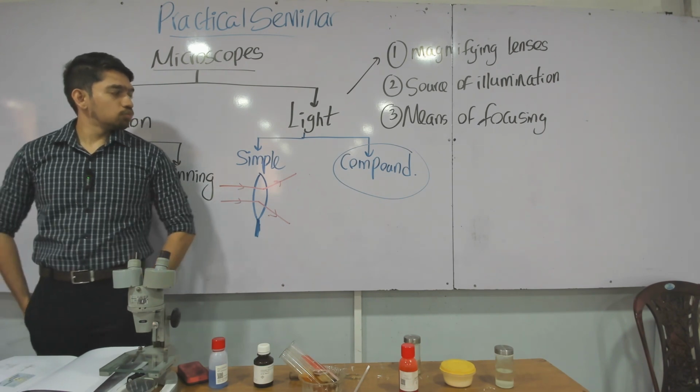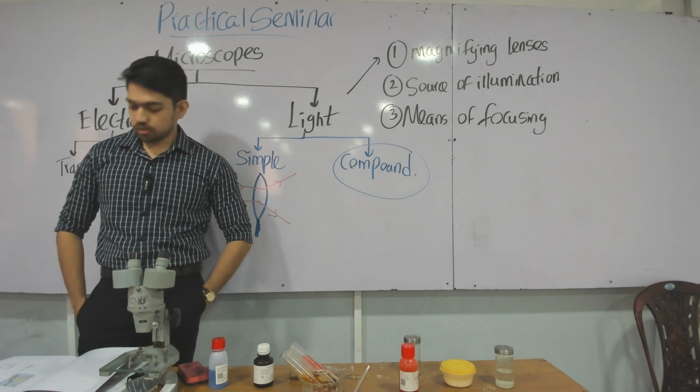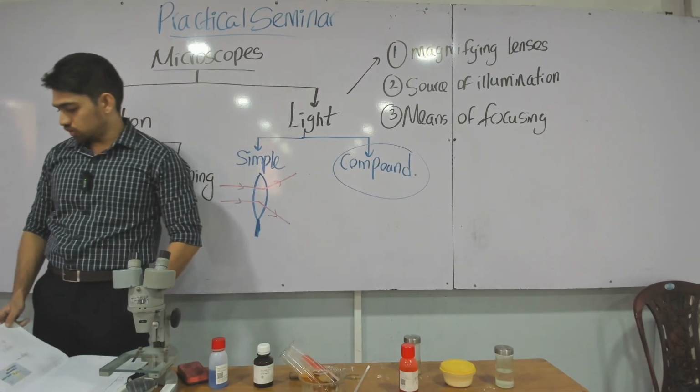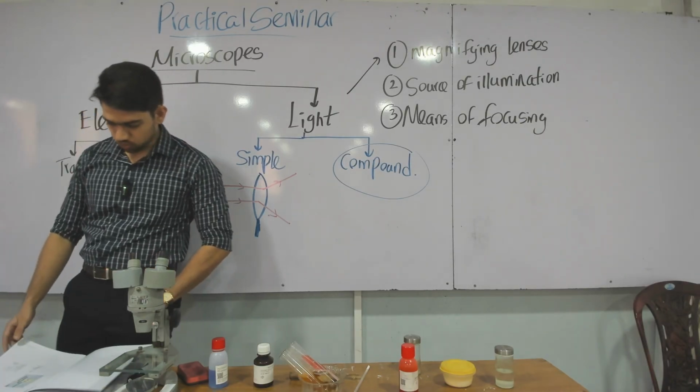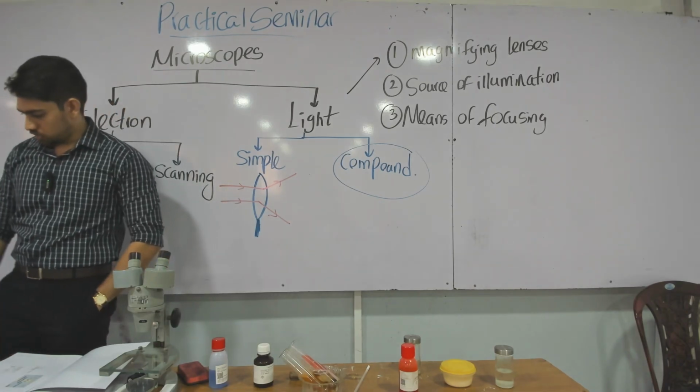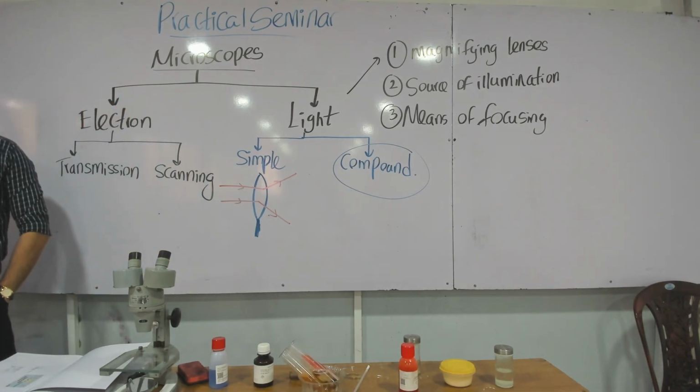So we can move on to the proper light microscope components. Any questions?